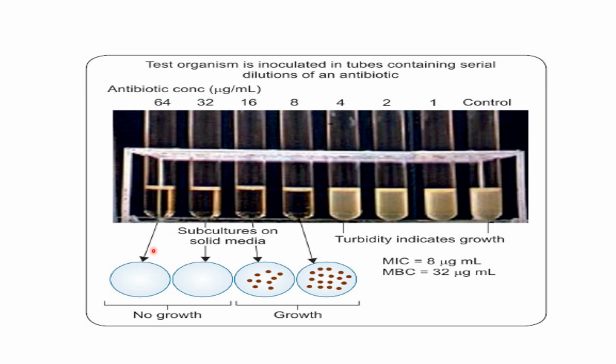After subculture onto solid medium, we incubate the plates overnight, 16 to 18 hours at 37 degrees Celsius. And we observe whether any growth is present on the solid medium.